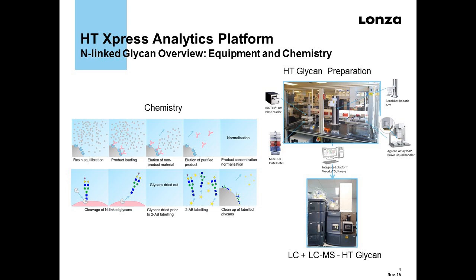This diagram shows an example of a monoclonal antibody purification. However, for products with no affinity to protein A, an appropriate resin for a recombinant protein can be used for the initial purification. The onboard purification suitable for affinity resins, such as protein A, starts with resin equilibration followed by product loading. As it is an affinity resin, the non-bound, i.e. non-product material, can be washed away, allowing the product to be released in a separate step, which generates a product with high purity, normally over 95%.